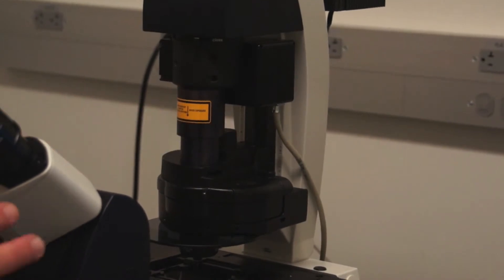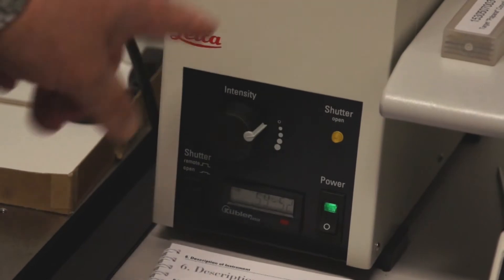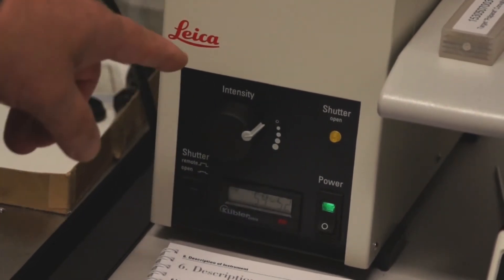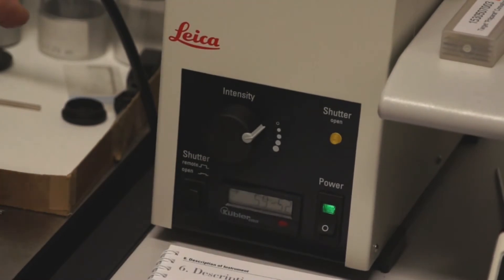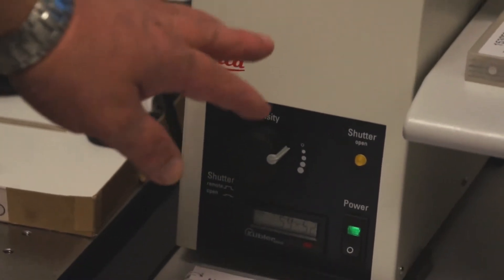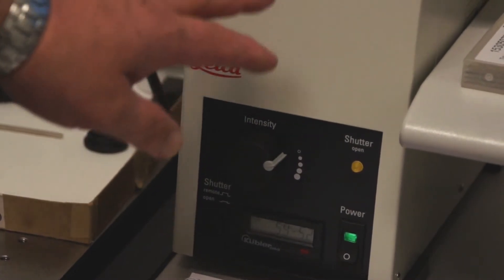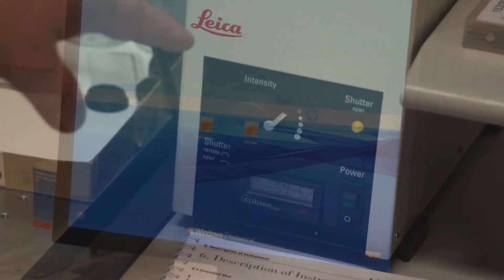Now the microscope is ready to be powered down. Do not forget to turn off the mercury burner before you turn off the microscope. This is a very expensive bulb and the wave guide gel is very expensive. One person already left it on over a whole weekend and we had to replace a $500 bulb. So turn off the power on the front of the mercury burner lamp house.